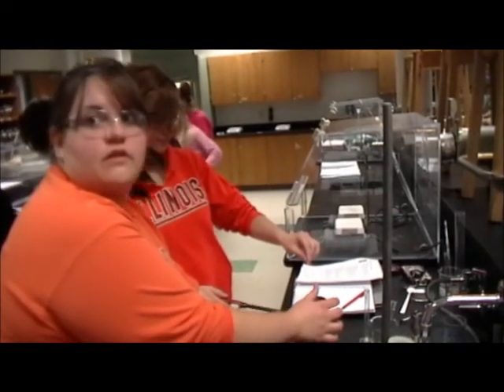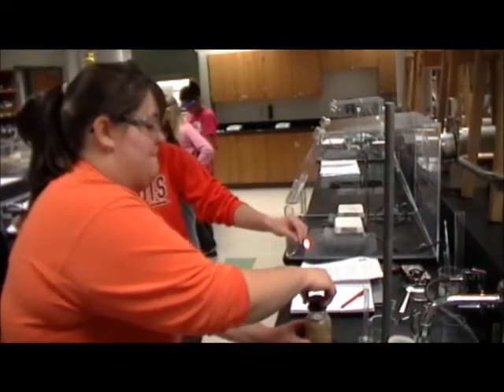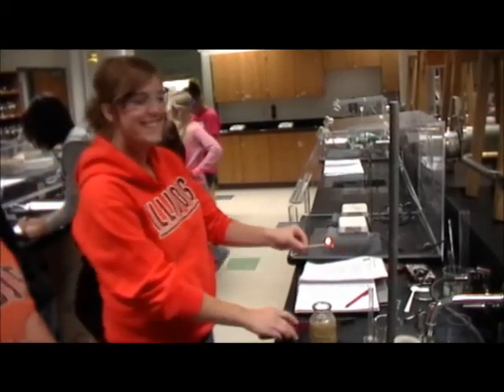Do we blow it out? Sorry? Do we blow that out? No, it's okay. It's hydrogen you're trying to burn. Okay. Right. Woo! Excellent, well done. Yay!